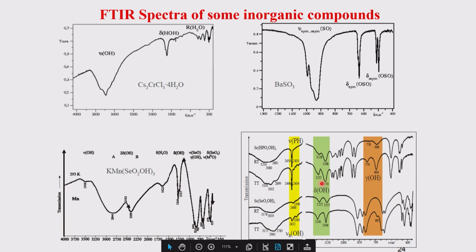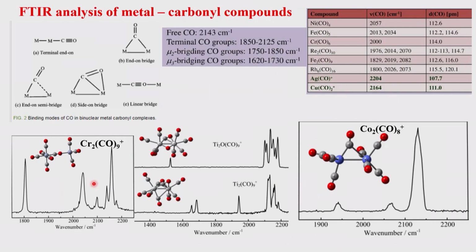So primarily you will see that whenever water is dominating, your metal related ones come below 1000, even below 500. Some groups like sulfate, nitrate, perchlorate come within the 500 to 1200 range, etc. You can see all of them.